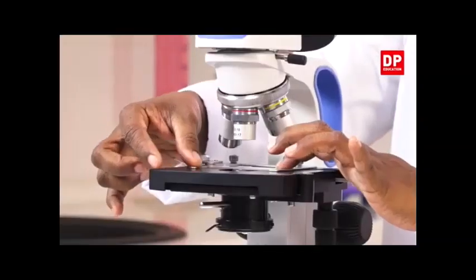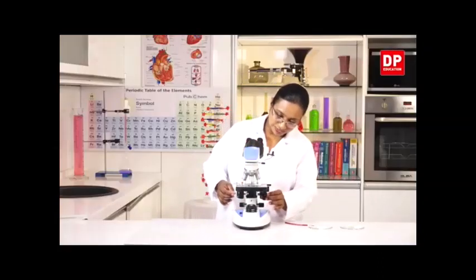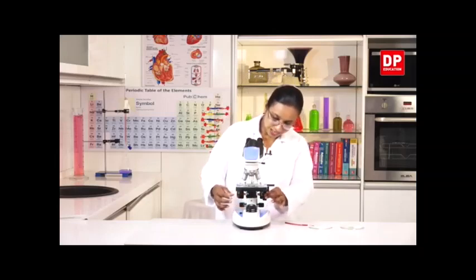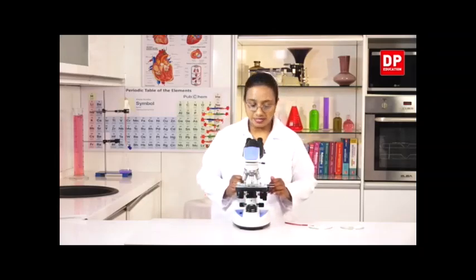Here you can see I will place it on the stage, and we have to adjust the sample so that it comes in line with the part where we have the light falling on it, where the lenses are, so that we can observe it clearly.